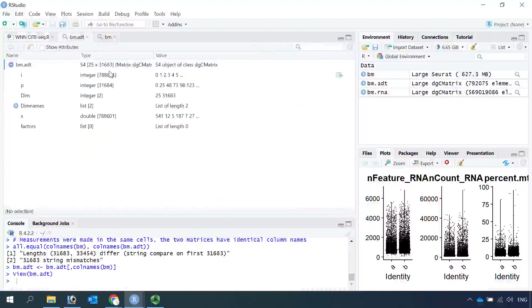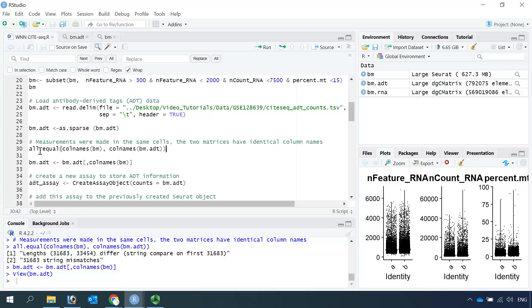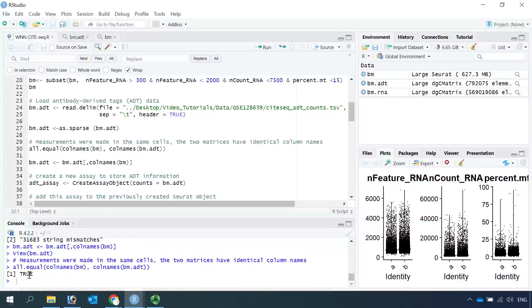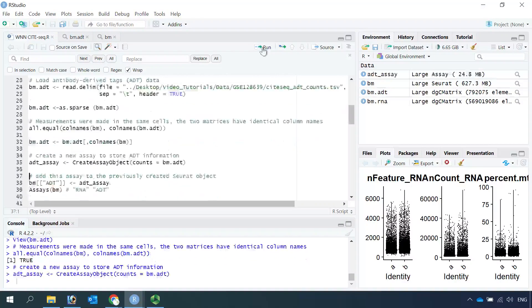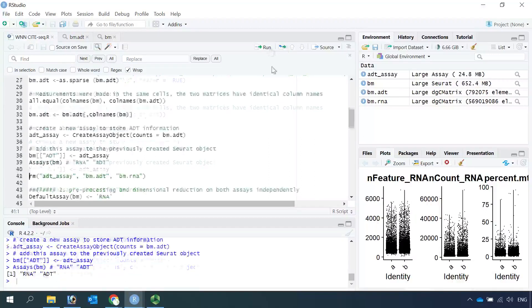If we look at the ADT dataset now, you can see we only have 31,683 cells — the same number as the RNA dataset. If we check the cell numbers between RNA and ADT again and run this code, now the answer is TRUE. We have the same number of cells in both datasets. Now we can create an assay object as ADT assay using the ADT matrix data, then add the ADT assay into the Seurat object.